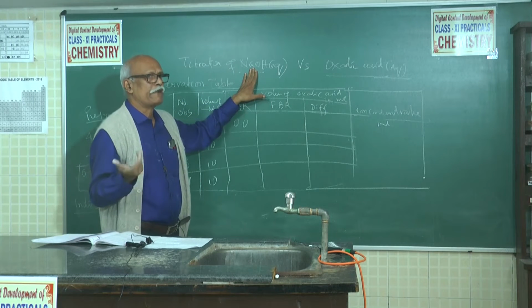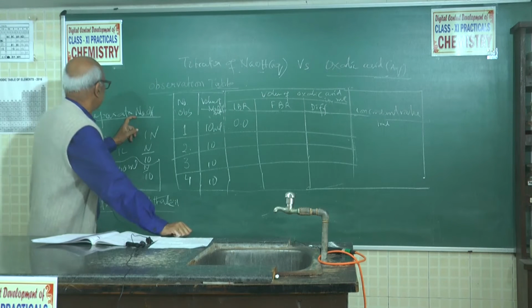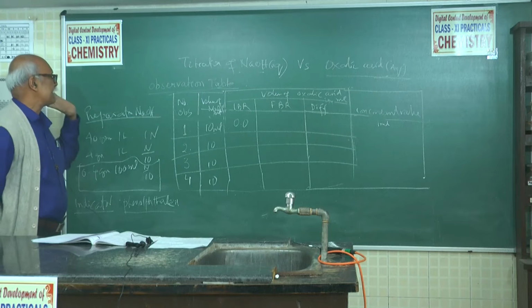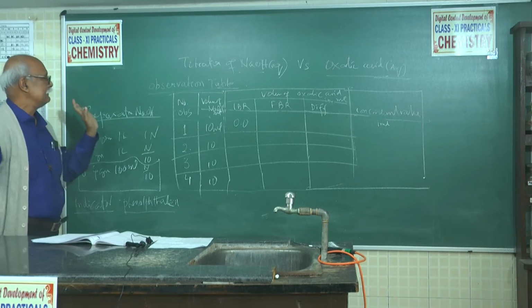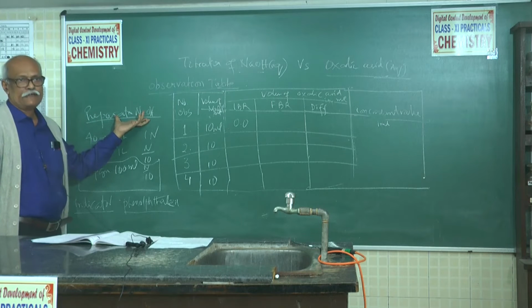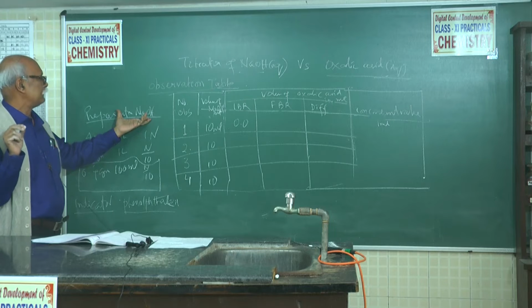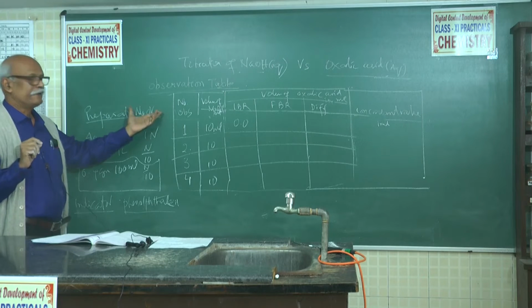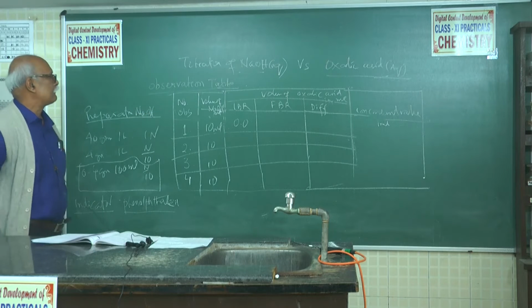Approximately, you take the weight of this. Say you prepare some sodium hydroxide, which has molecular mass 40 and its equivalent mass is also 40. Why does sodium hydroxide have identical equivalent mass and molecular mass? Because its acidity is 1. Acidity means the number of H plus ions necessary for neutralization. Sodium hydroxide plus hydrochloric acid gives 1 mole of OH minus and 1 mole of H plus.